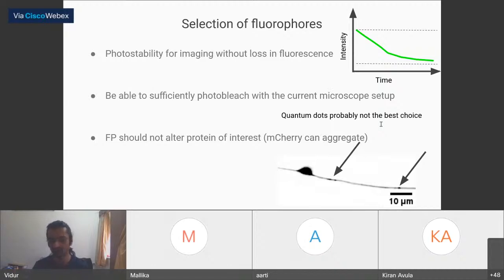If you take care of all of these and you still have only, let's say, 40 or 60% bleaching, then that's a caveat, and you really can't prevent the system from doing that. So you'll have to continue with your experiment.